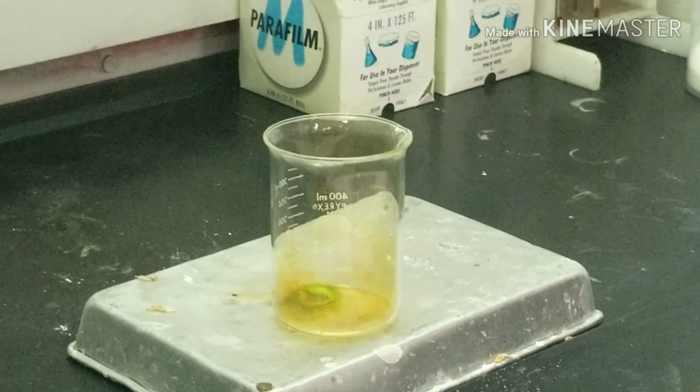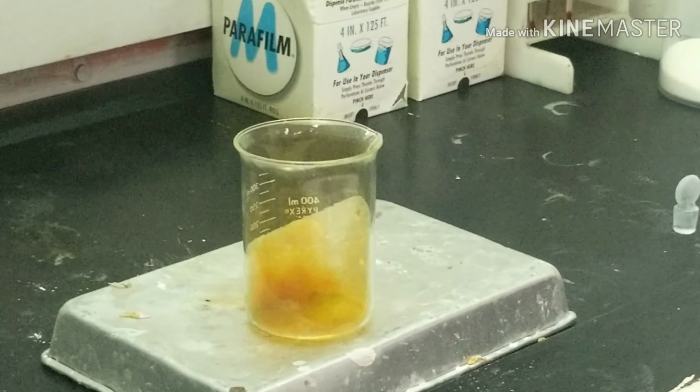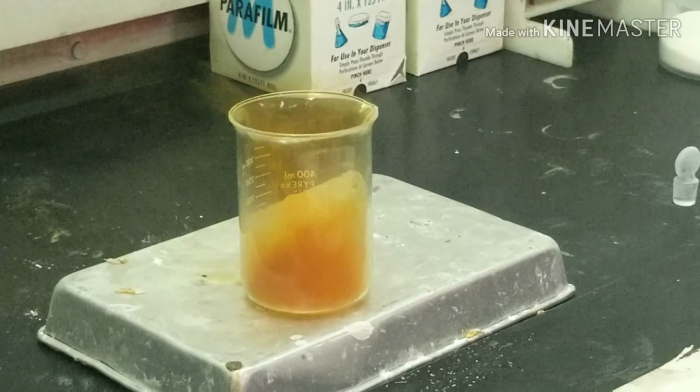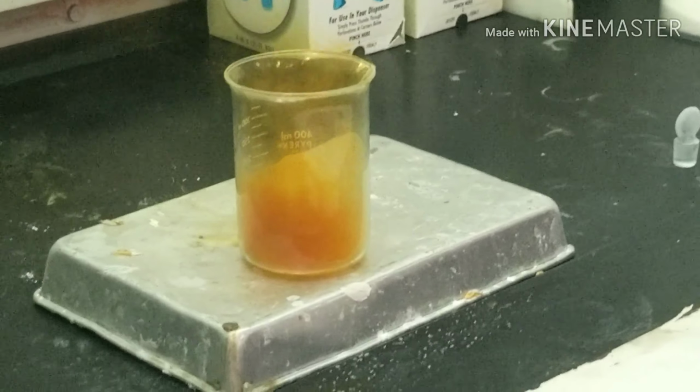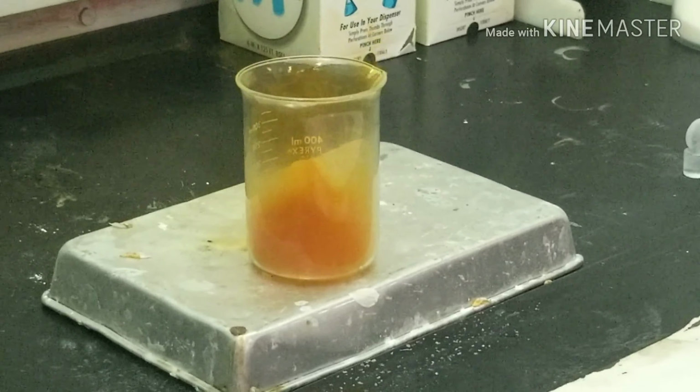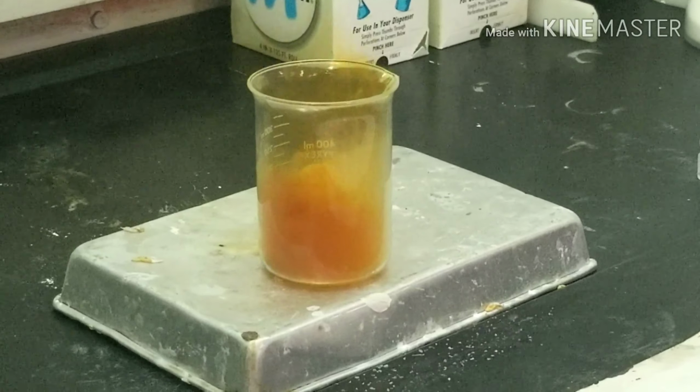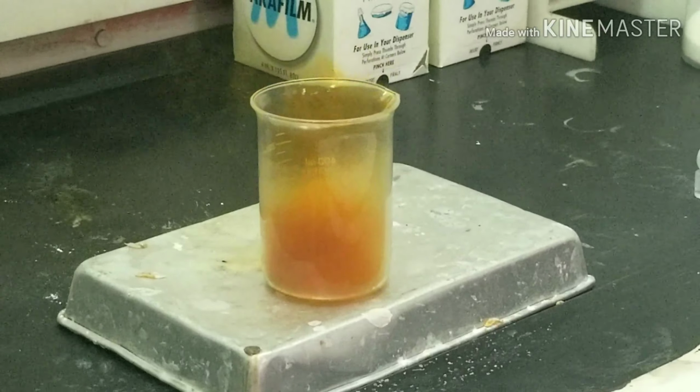We're starting to see a little brown gas. That's that nitrogen dioxide gas. Certainly, we want to have the fume hood on like we do in this reaction. We don't want to breathe in that gas. Exothermic as well. That would be fairly warm at this point.